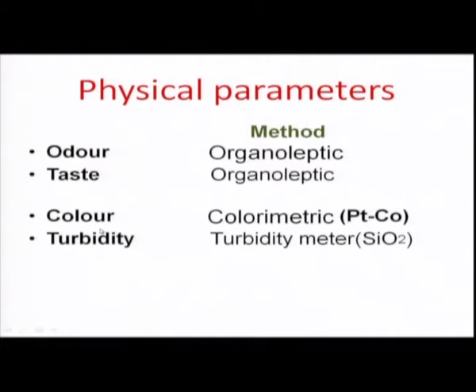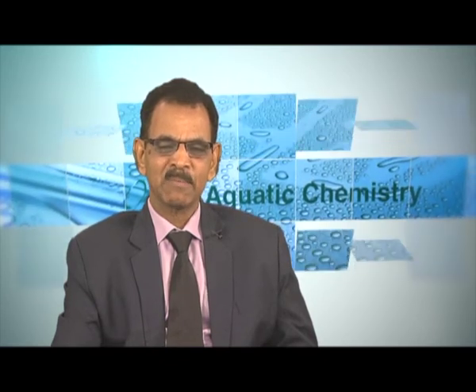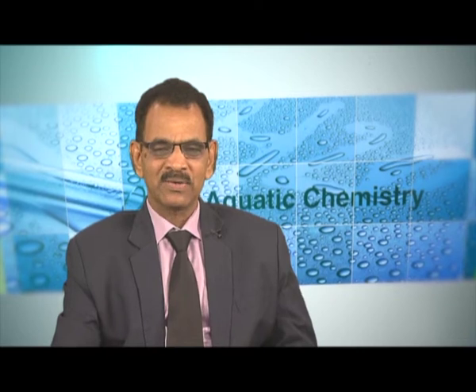which appears slightly yellow for natural water and is usually determined by what is called the platinum cobalt scale using colorimetric methods, using a UV visible spectrophotometer, which is normally represented in Hazen units. Suppose we dissolve 1 milligram of platinum salt that is tinted with cobalt chloride, that gives exactly the similar yellow color resembling that of natural water. So, this is the one used for measuring water color, the platinum cobalt Hazen unit.